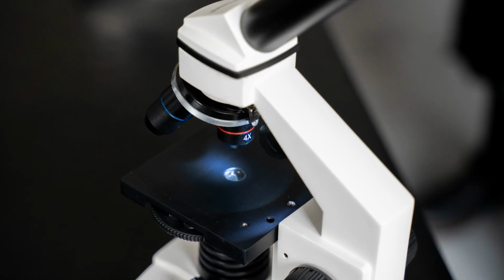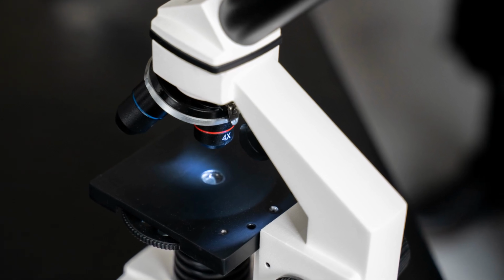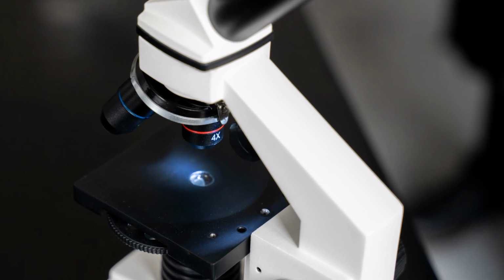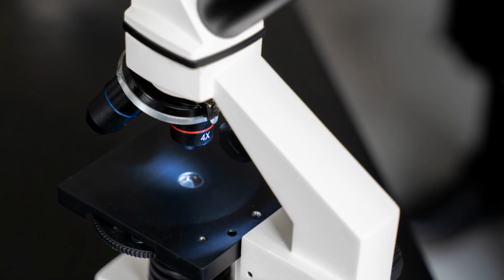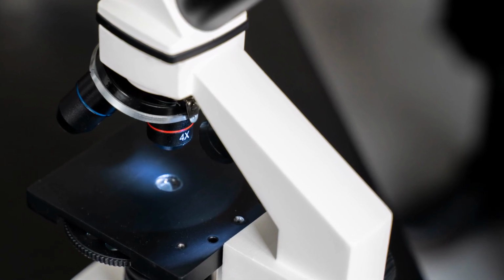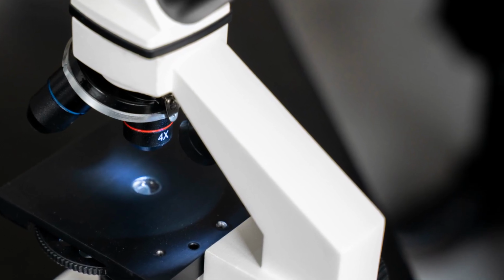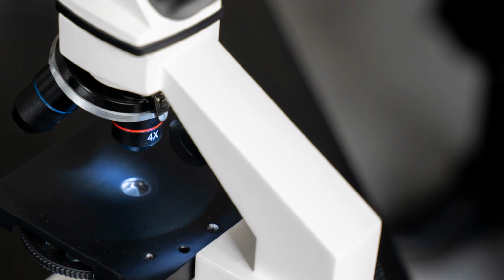Another exciting trend is making microscopy more accessible. While high-end electron microscopes are still massive, expensive machines confined to special labs, light microscopy is becoming more portable and affordable. There are now high-quality portable microscopes that can be used for disease diagnosis in remote villages.